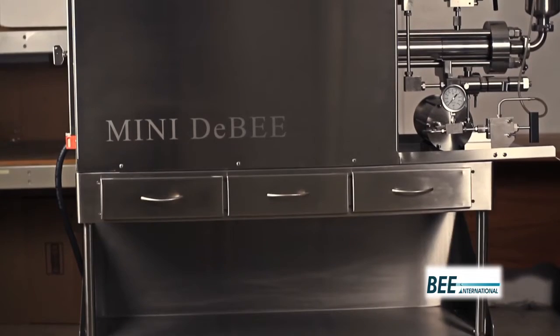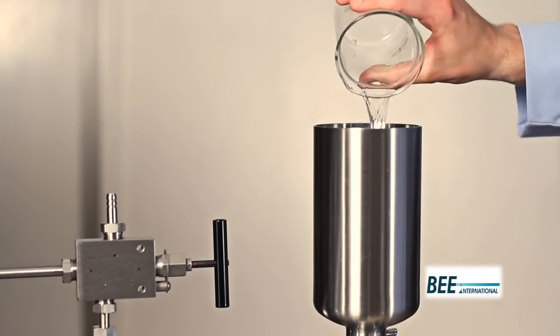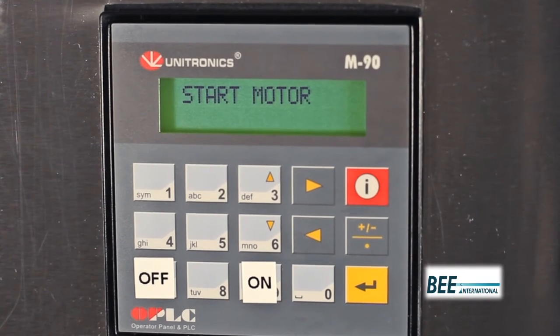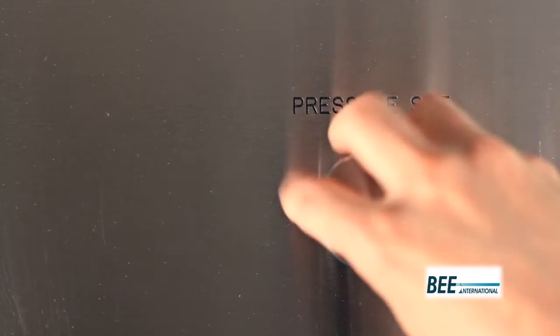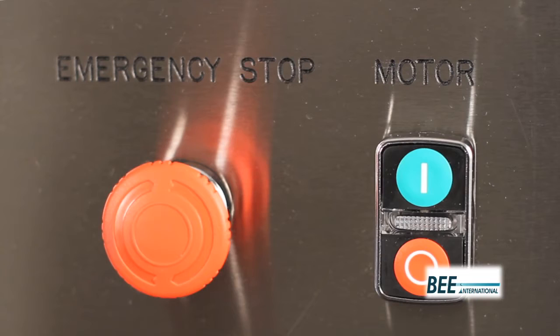To operate the Mini DeBEE, first ensure the inlet reservoir is filled with product and the system is primed. Press 1 on the PLC to enable normal run mode. Turn the pressure set dial counterclockwise for the lowest pressure setting. Then turn the motor button on.